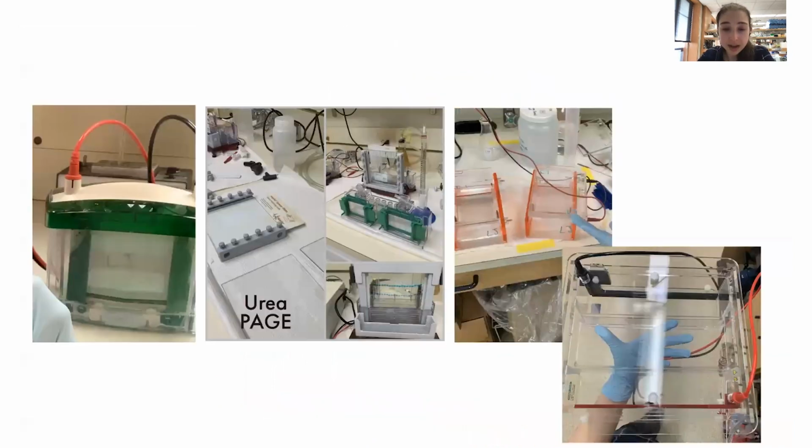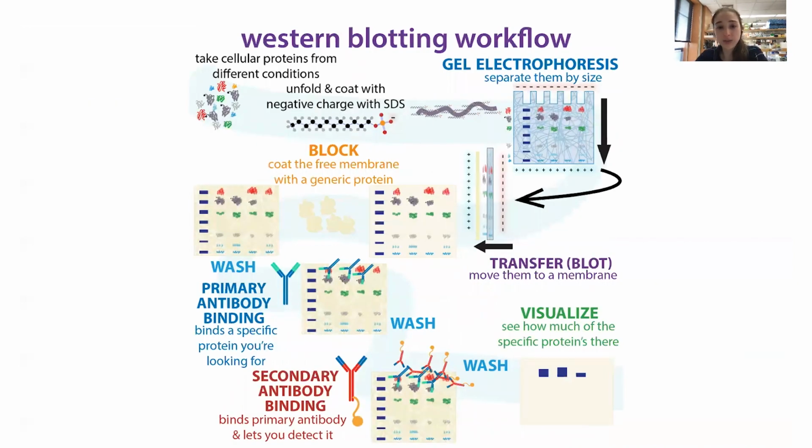The first step in any of these, well, not quite the first step, the first step is going to be to isolate the thing that you want. So typically we're starting with some sort of cells, and we're trying to see what's going on in cells. And that's why we have to go through all of these things to fish for various things, because there's a lot of stuff going on in cells. It's not like we just mix a couple of proteins that we purified. We are dealing with this whole mixture, and there's so much stuff in there.